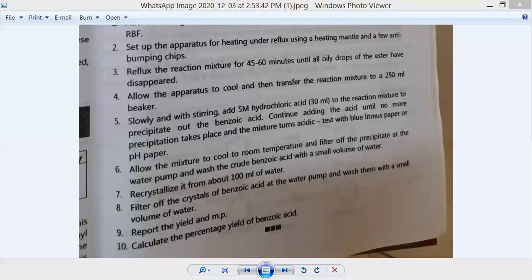Yes, it is going inside. Judge Yes, madam. percentage yield, it must be above the 90%. Sir, suppose again I will repeat.